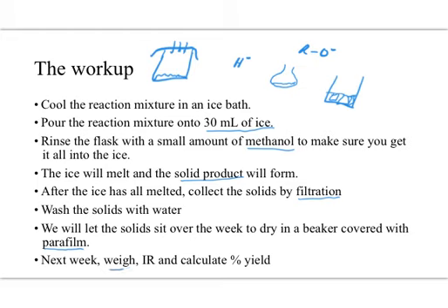Next week we'll get the weight, we'll get an IR spectrum of our material, and we'll calculate the percent yield, and we are finished with labs after this.